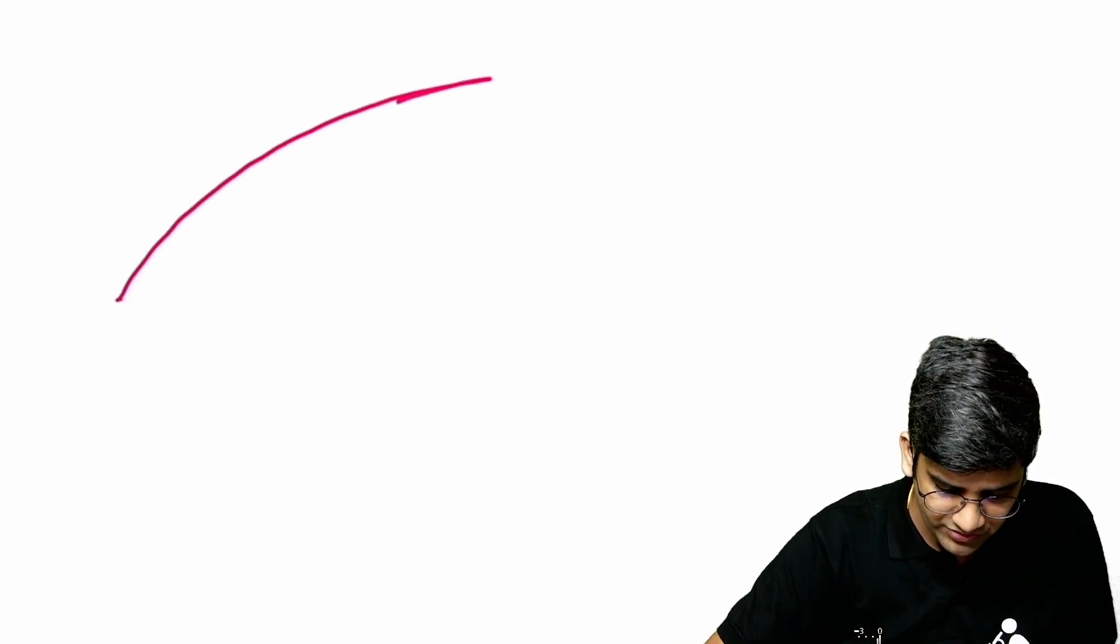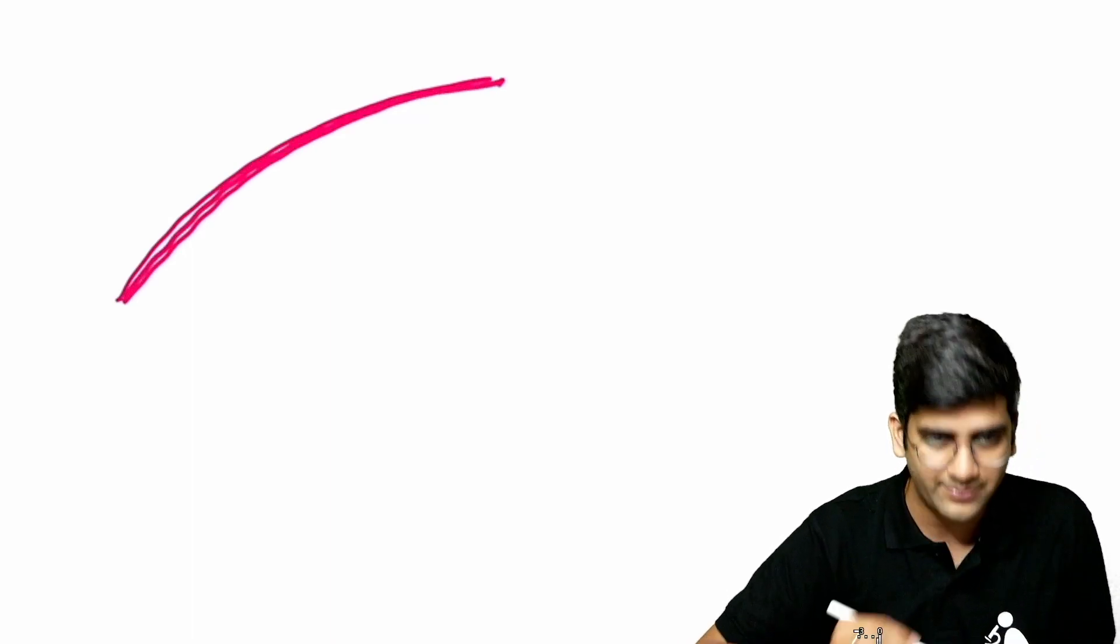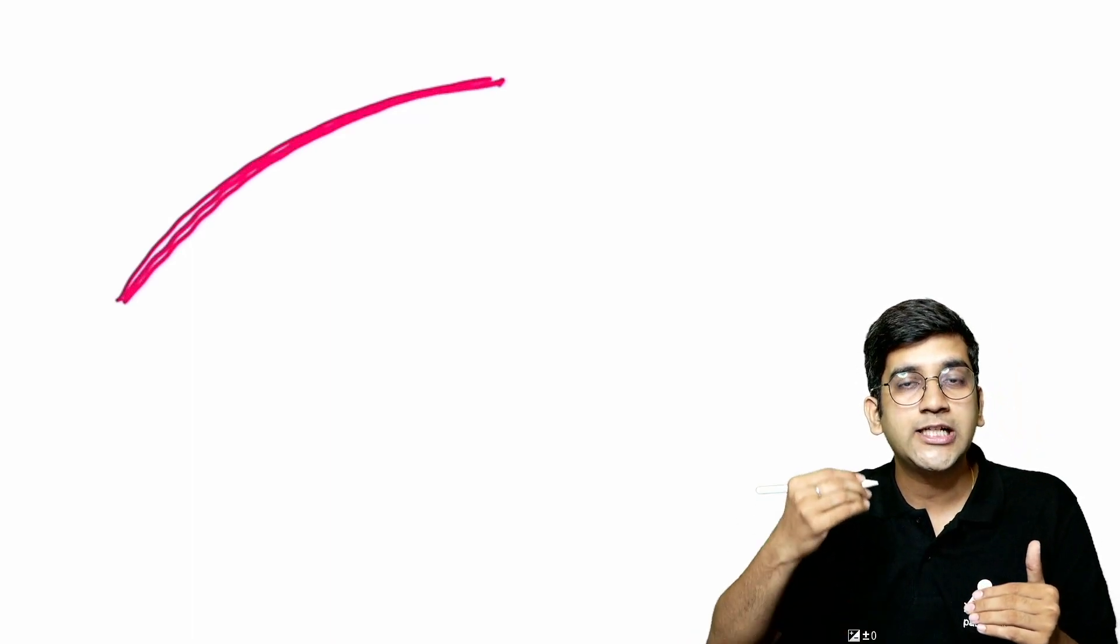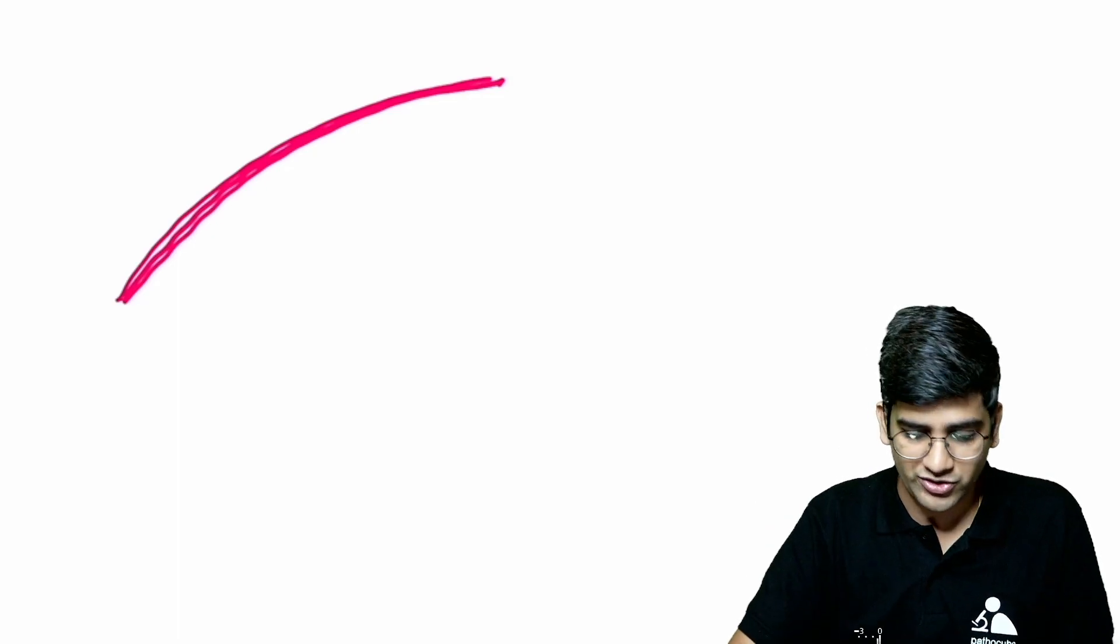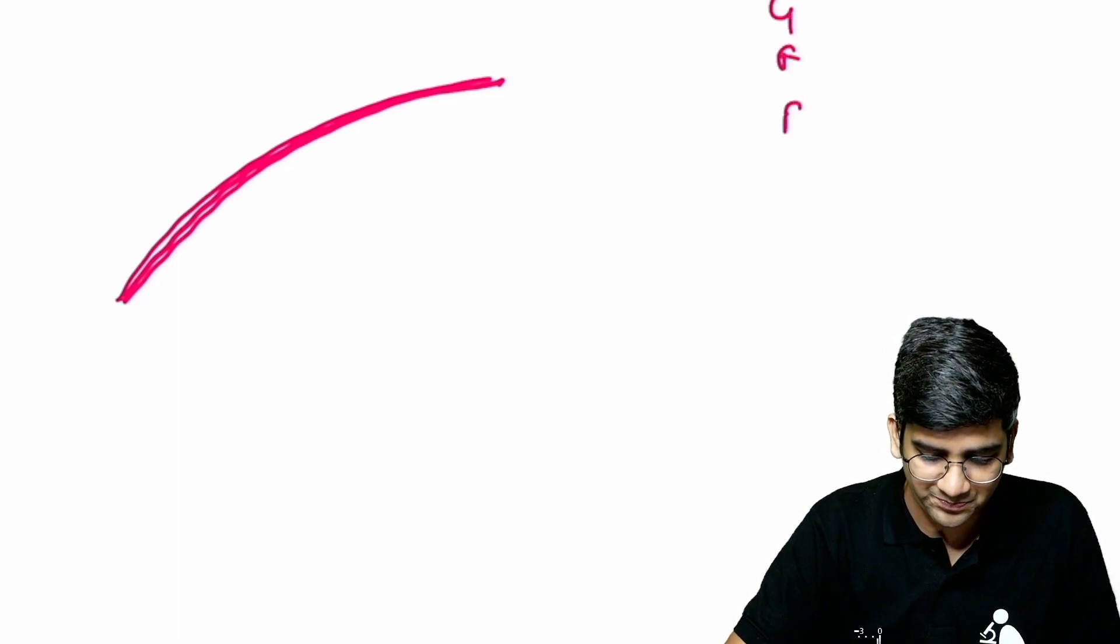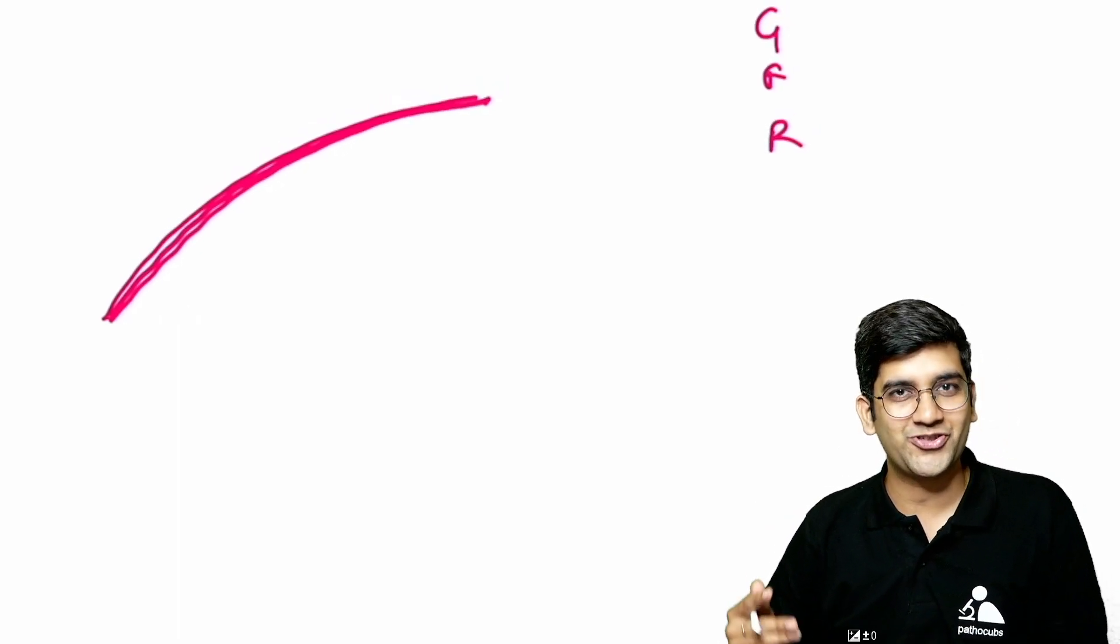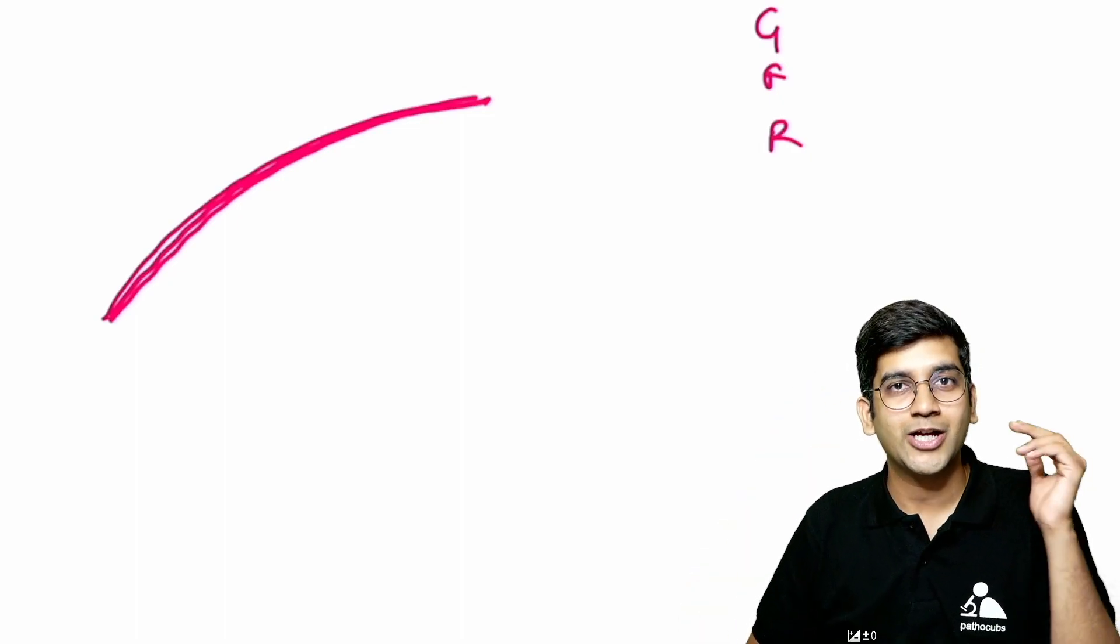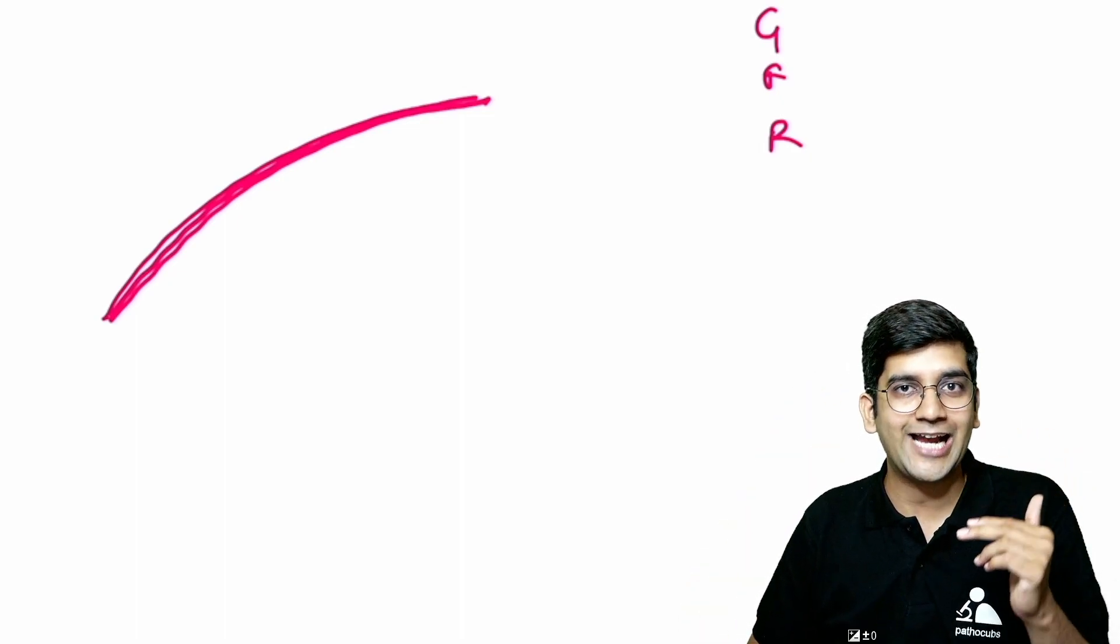So adrenal cortex has an extremely thin capsule here. The adrenal gland will have a capsule here. Below the capsule the first layer is your glomerulosa. You will never forget this. GFR. The mnemonic which you have been reading from the first year of MBBS. Glomerulosa, fasciculata and reticularis.